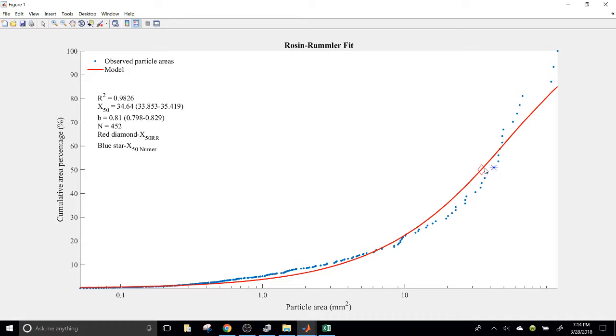It's just describing a distribution that's not really the one we're working with. For 2, in the case that we have a very sparse data set with maybe only 5 particles, it's possible that we don't have any particles anywhere near this value. This is just giving us a statement of where we think it would be, if that makes sense.